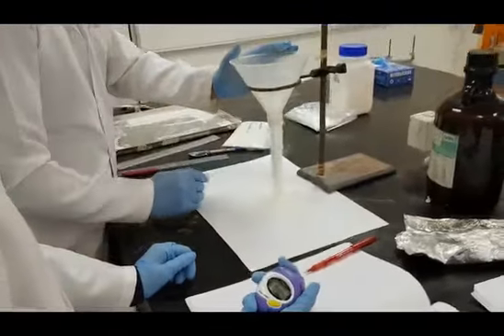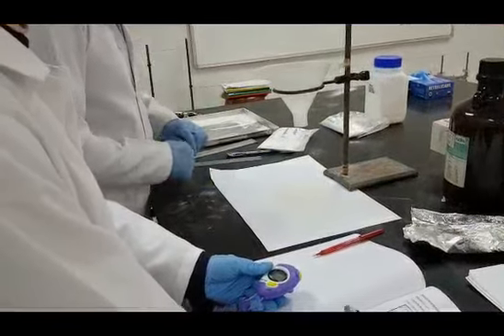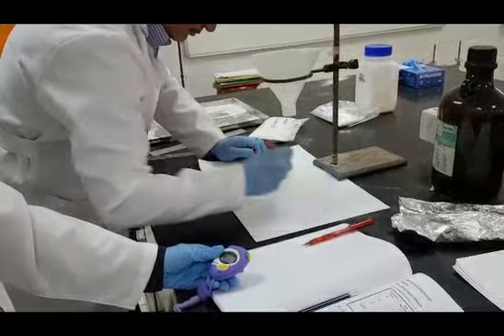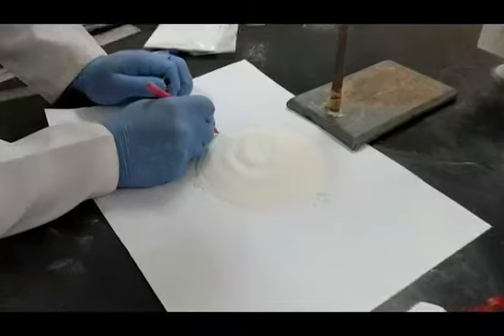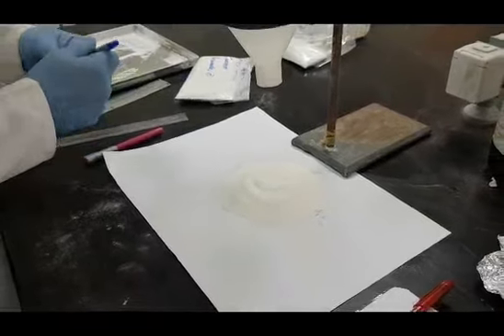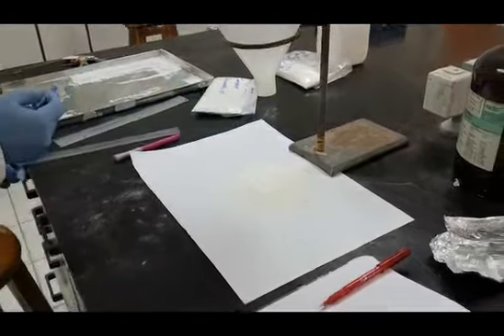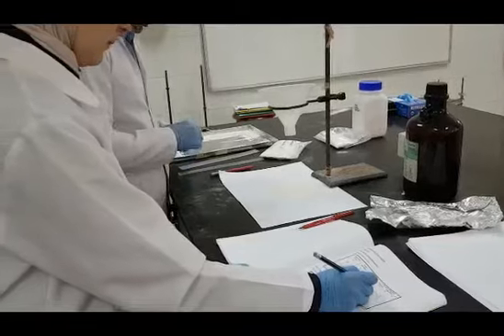Start. Stop. After performing the 3 trials, please return the particles to their main container or plastic bag.